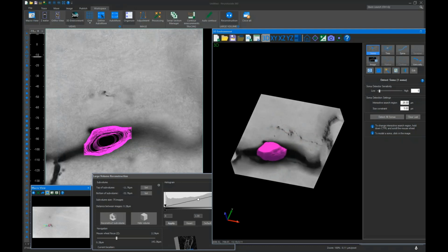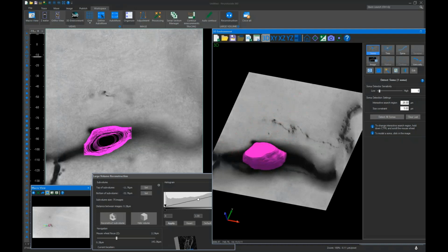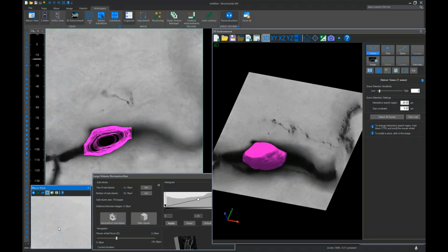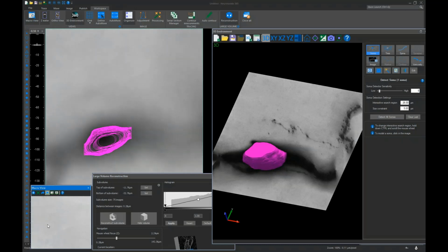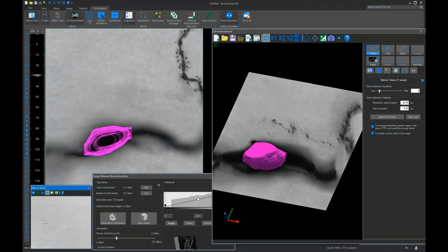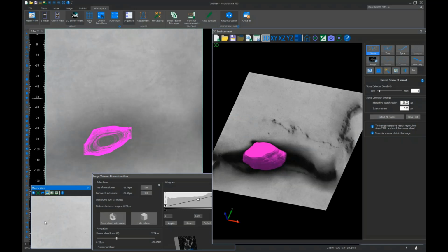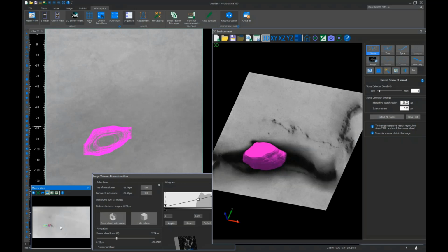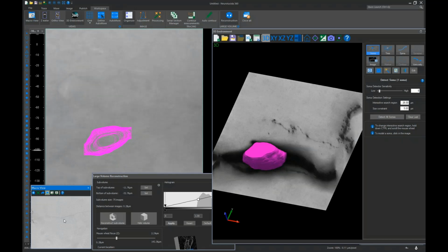And so you can use this process literally to hop anywhere you want. So that's right. So in the macro view right now, Sue's zooming in on an area that it appears that there was nothing. But as you go through and focus a little more, depending on which direction, there might be processes within that area that you might not have noticed if you were looking at it through the entirety of the image. So there was something that was coming into focus, and you can see it slightly there.